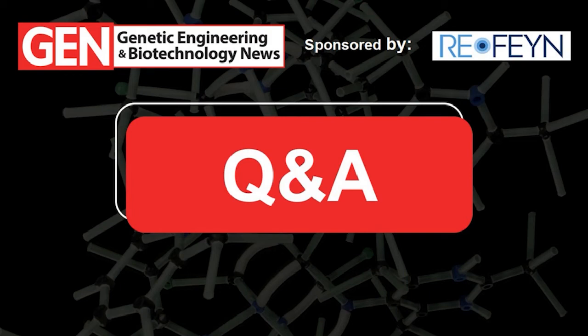All right, thanks. Next question we have, this is a good one. Could you tell us a little bit more about the calibration sample, about what it is, perhaps? Sure. So basically, for calibration, you just need a protein of a known mass that is within the measurement range of the mass photometer, so between 500 kilodalton and 6 megadalton. We typically recommend at least a 2-point calibration. So what we can recommend in terms of what's available commercially is thyroglobulin, which gives you a peak at 670 kilodalton, and then add an empty AAV to that of which you know the mass, and then typically this is good enough to calibrate the system for mass.